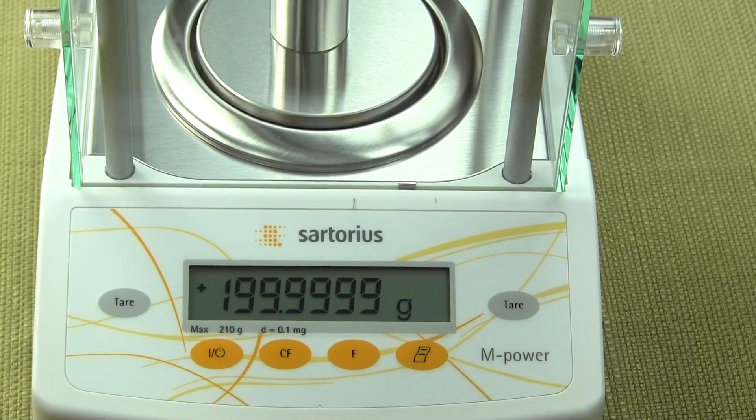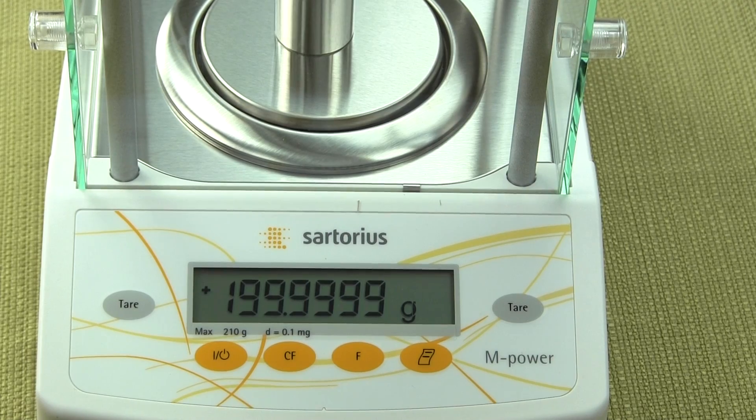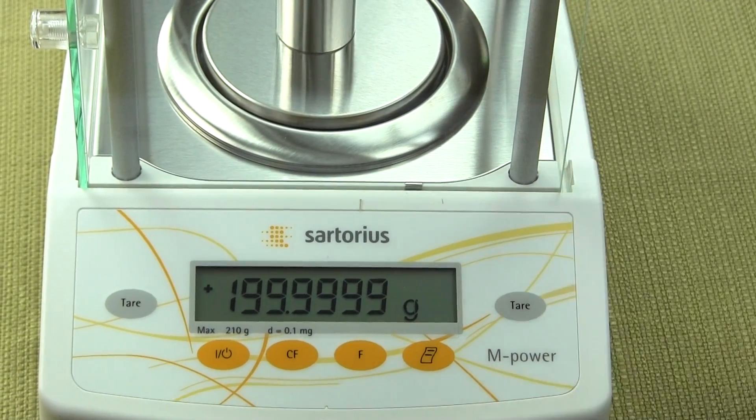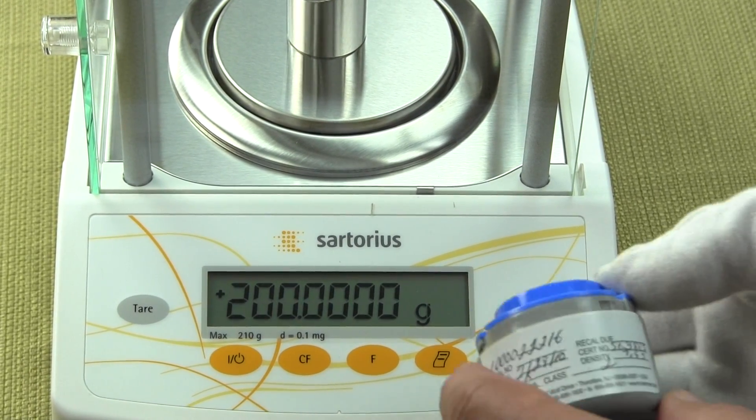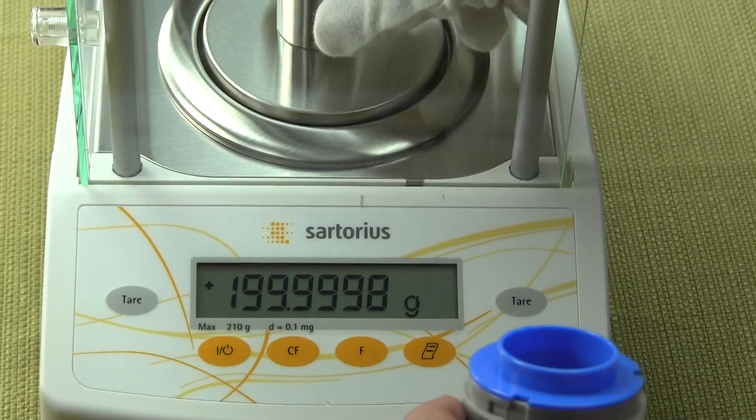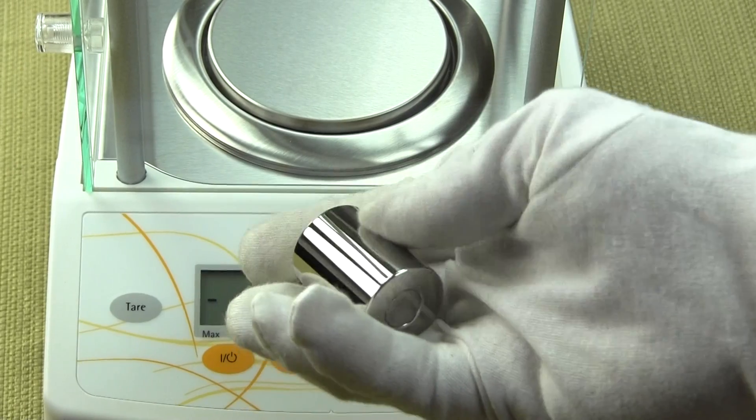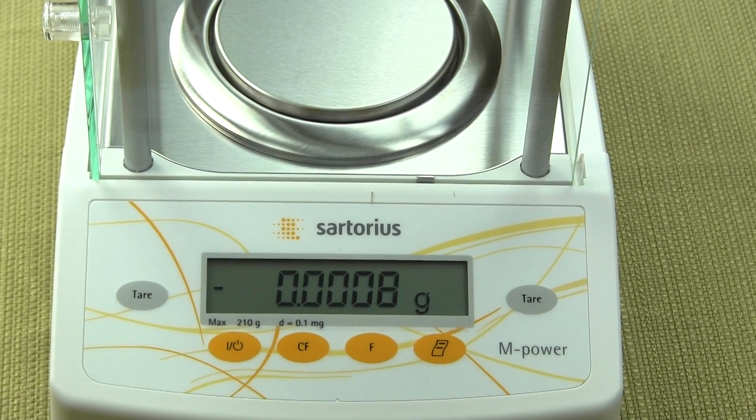Now, the calibration weights do not come with the balance itself. It's an optional accessory and we do highly recommend them. This particular weight we're using is an ASTM class 1 calibration weight. You can see it's high quality, stainless steel, satin finish. We definitely recommend you buy the calibration weight.